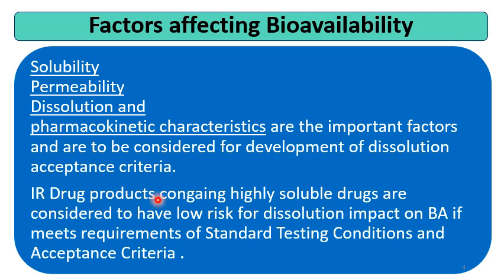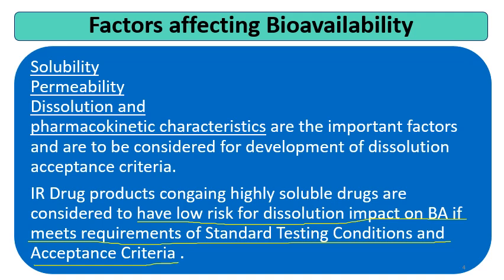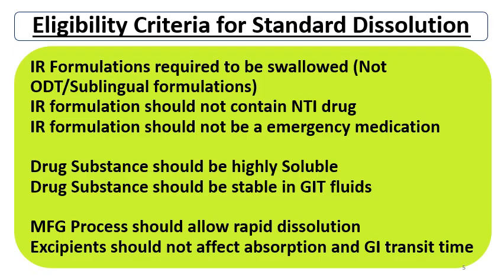IR drug products containing highly soluble drugs are considered to have low risk. These formulations are considered to have low risk in the bio studies, that is impact on bioavailability and bioequivalence. And if the formulation meets the requirement of standard dissolution testing conditions and acceptance criteria, then it is generally understood that the formulation has less risk of failure of bioavailability and bioequivalence. That's why these standard conditions are made, and in detail we are going to study it.